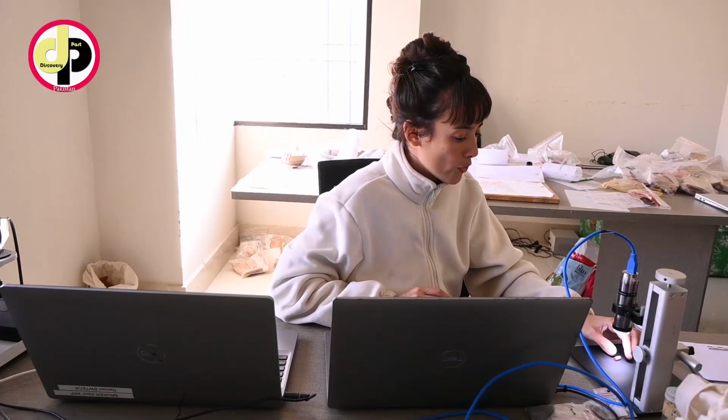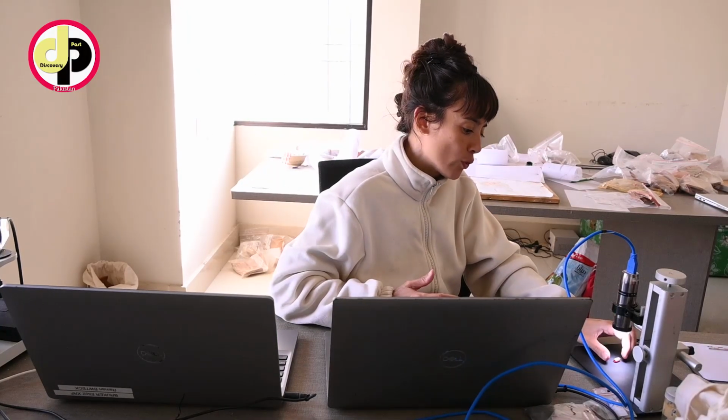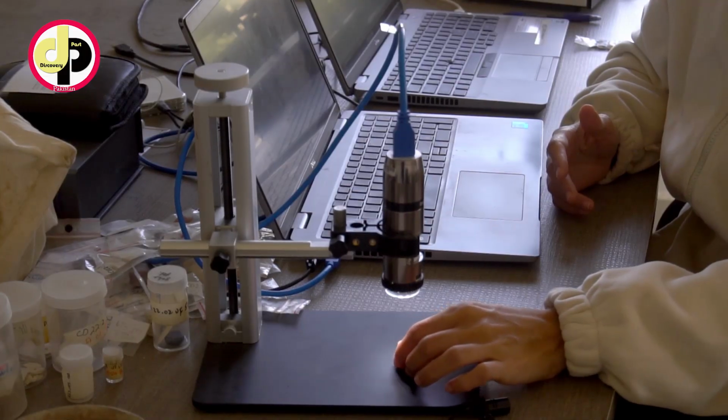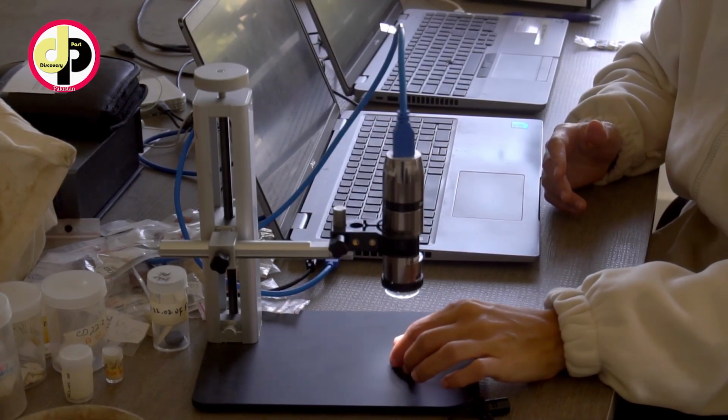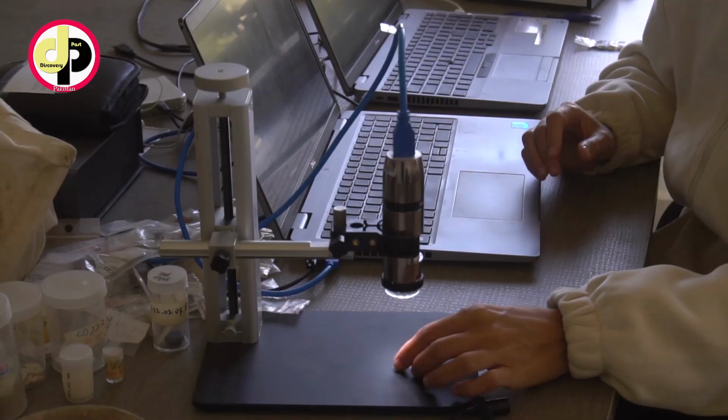So among the instruments that I brought, there is a small field microscope, which is a Dino-Lite. It's really a basic microscope, but it's just to take some microscopic pictures to get some details of the materials that I'm analyzing.